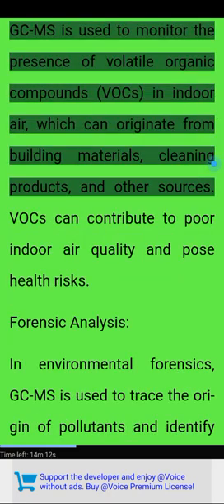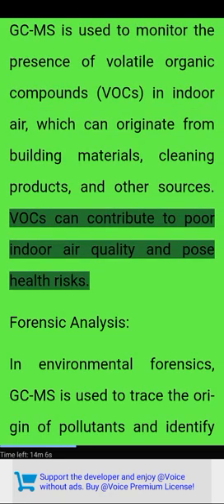Indoor air quality studies. GCMS is used to monitor the presence of volatile organic compounds, VOCs, in indoor air, which can originate from building materials, cleaning products, and other sources. VOCs can contribute to poor indoor air quality and pose health risks.